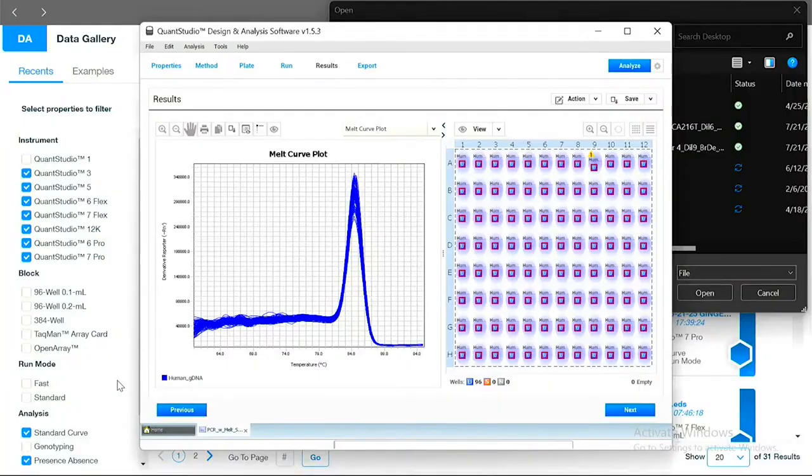But yeah, just if you need to write on the plate, which everybody wants to write on the plate, I do it, other people do it, just make sure it's on the edges or away from the actual well itself where it can bleed in.